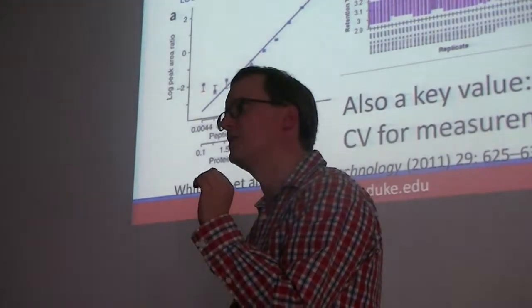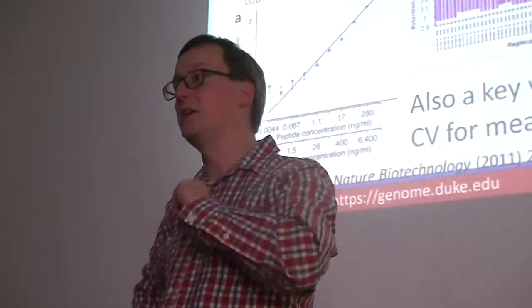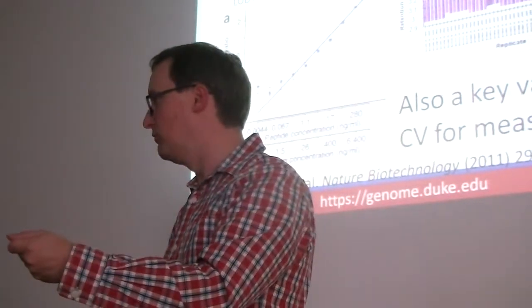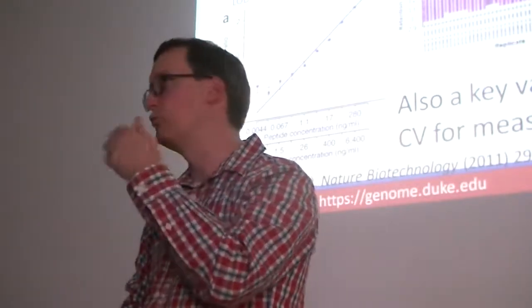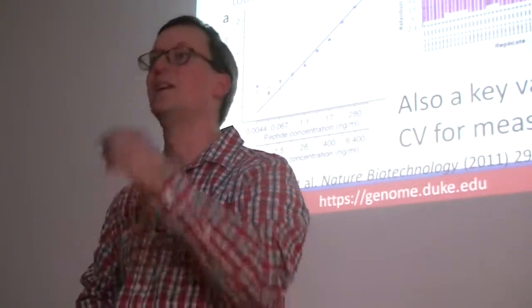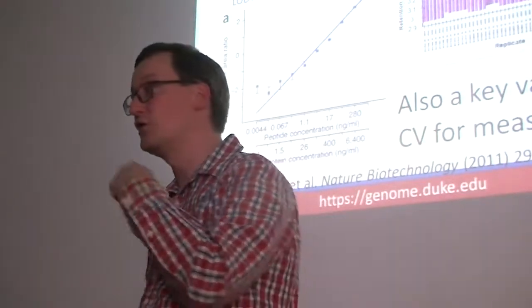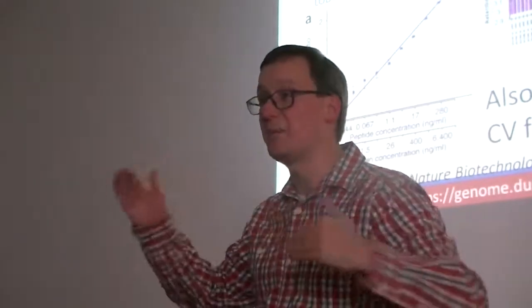And the reason for this is that you would like to know the range of linearity for that quantitation method. Which is to say, if you put in 1 unit of sample, you would like to know that the instrument is responding with 1 unit of intensity, or 1 unit of quantity in response. If you put in 2 units, you would like it to double to say there are now 2 units present. If you put in 3, you want it to say 3. But if you suddenly throw in 10,000 rather than 3, your ability to determine that 10,000 is 3,000 times the size of 3 is putting quite a strain on most of these instruments for their dynamic range.